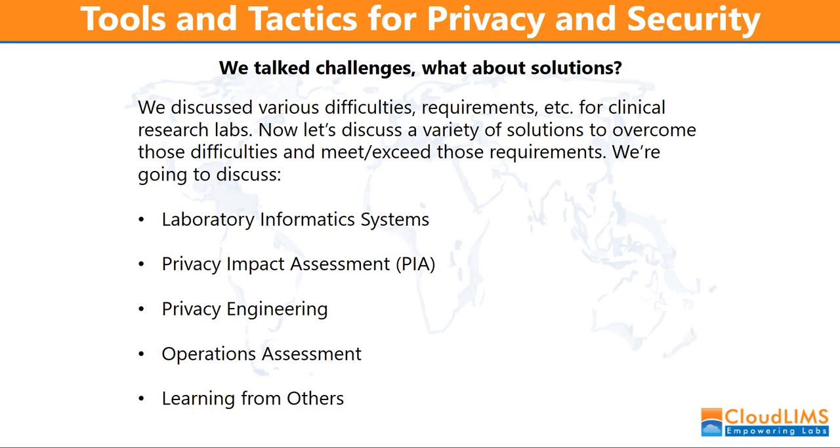So here are some tools and tactics for privacy and security. Let's talk about solutions. There are laboratory information systems to safely manage laboratory data. They come in many varieties. Some are developed in-house with expertise, some are open source, and some are commercially available to set up and go. To make the right decision to cover your needs for a system, your needs must be assessed in several ways.